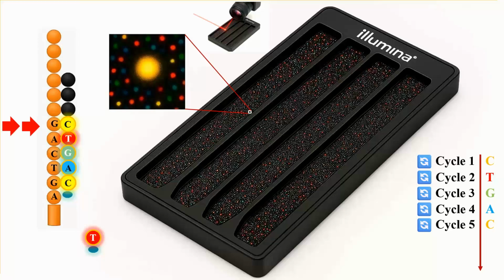Here we have discussed 4-channel SBS chemistry. There are other types of SBS chemistries as well, such as 2-channel and 1-channel SBS chemistry. However, we will not discuss those in this lecture.